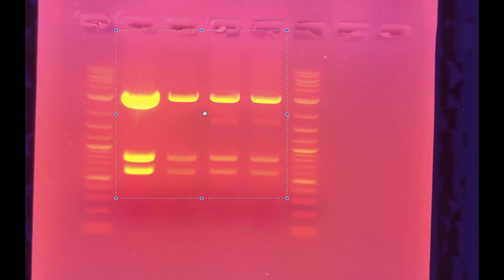However, you can see here that these bands appear on the right lanes, and on the left lanes there is no band here. So I thought, okay, what's different between these 2 samples and these 2 samples? And it occurred to me that I was using a different kit for prepping. So this is kit number 1 and this is kit number 2.